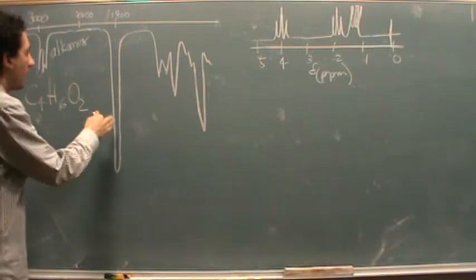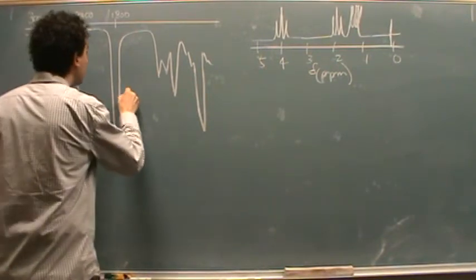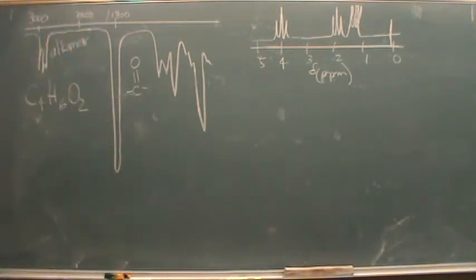So I have this monstrous peak on my spectra that's right here. This means I'm dealing with a carbonyl. Okay? So I've got a carbonyl because of that peak right here. And really below like 1800, I don't really care what the other stuff is. Again, if you're an expert or you're learning this in your class, that's totally fine, but I usually don't deal with those. They haven't been too helpful for me.